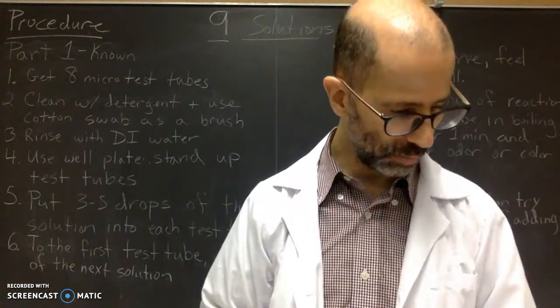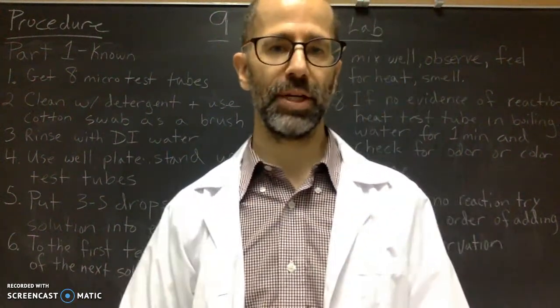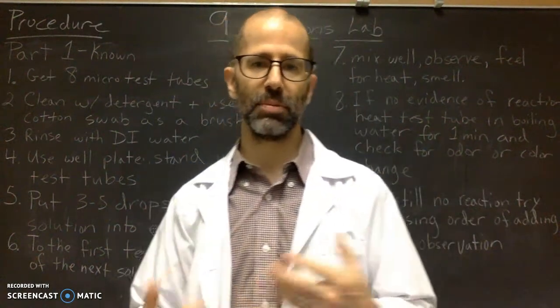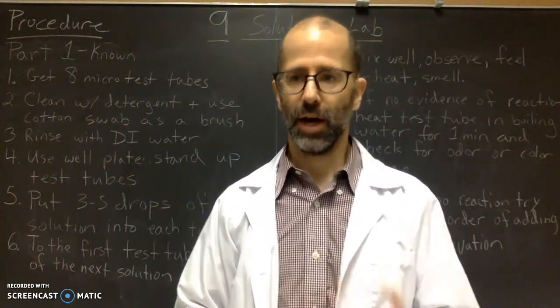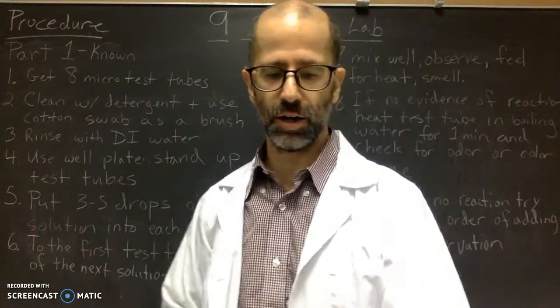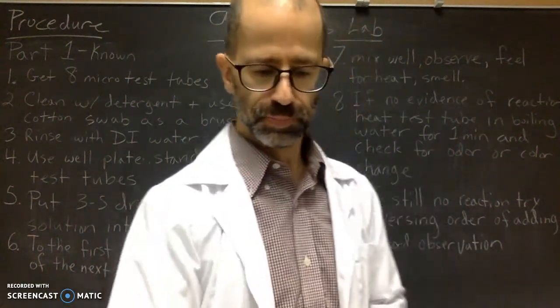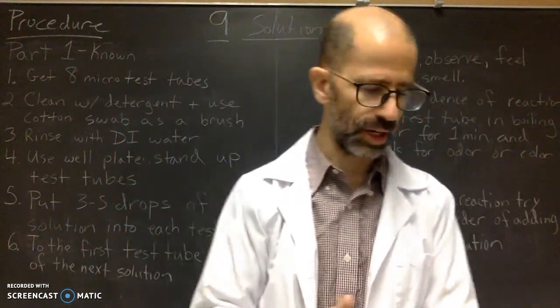Okay, so also you're going to need a waste beaker. So a properly sized waste beaker. You're going to be using a lot of fluid. Maybe a 150 milliliter beaker might be enough, and that's really all you're going to need.